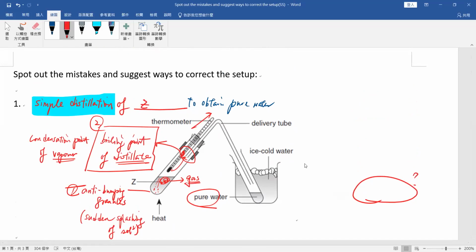So you are going to boil with bubbles, of course. Tell me any situation where the solution boils but without bubbles.